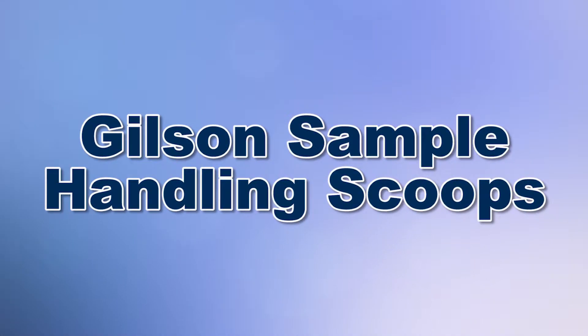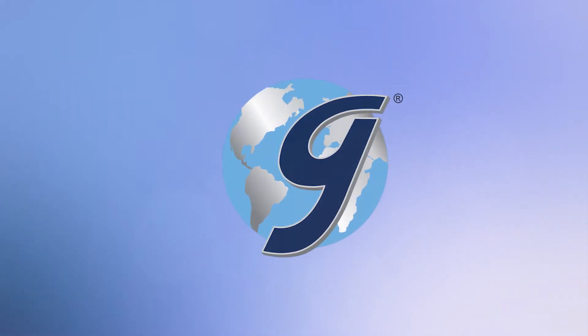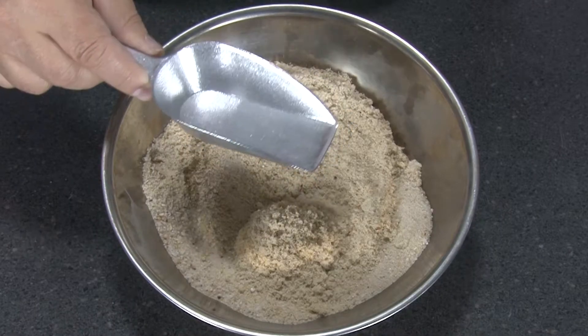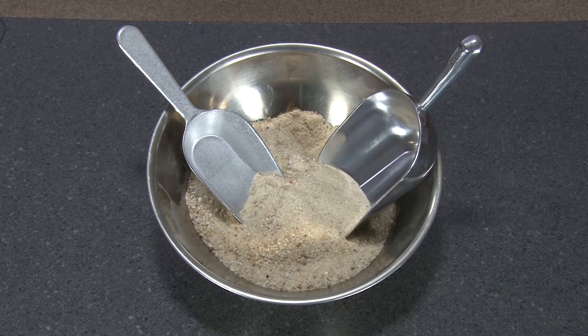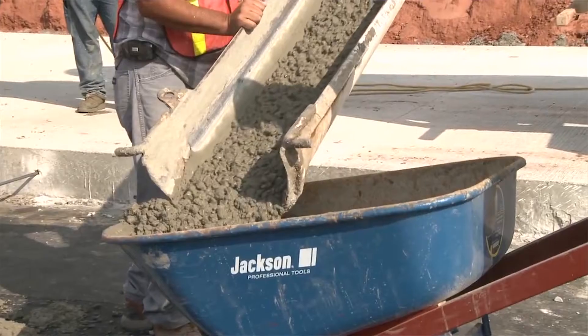When you need to make your sample testing easier and more efficient, then Gilson is the right choice. Gilson offers a wide array of round bowl and flat bottom scoops ideal for lab and field use, and are designed to handle sample materials ranging from fine powders to wet concrete.